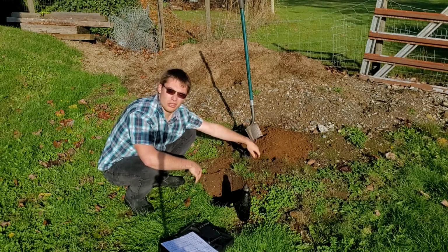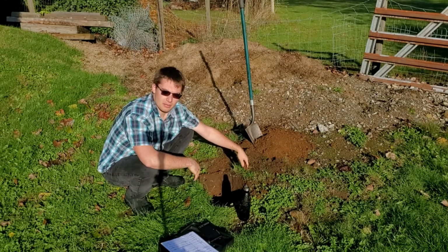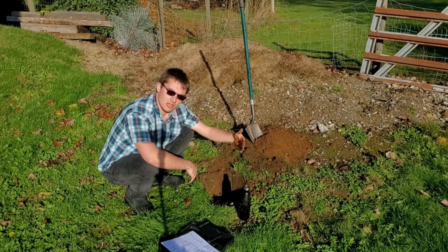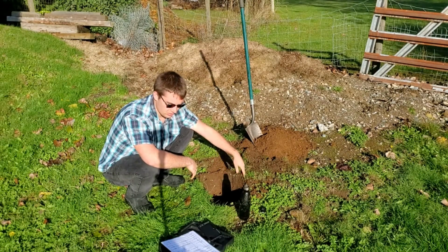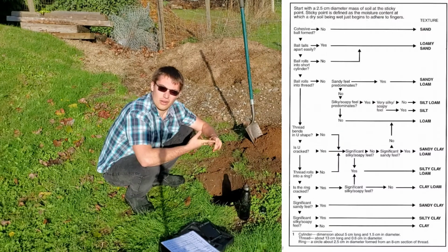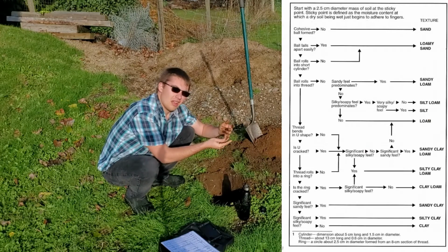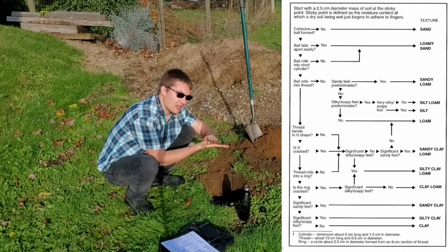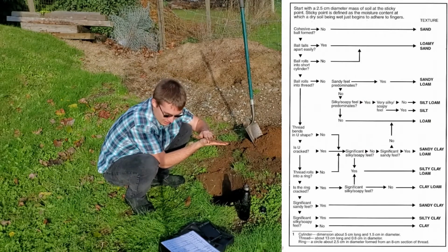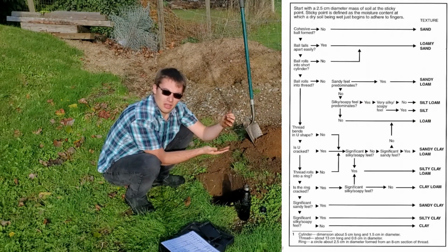Now, your soil will probably be different, and you just have to follow the same steps. You probably will have to go down further the checklist, but it is just very easy to follow. It's either yes or no questions. Yes, does it fall apart, or no, does it fall apart? The feel, you might have to get a little bit. A sandy soil will feel like sandpaper or a skin abrasive. A silty or soapy feel will be nice and smooth like a bar of soap.